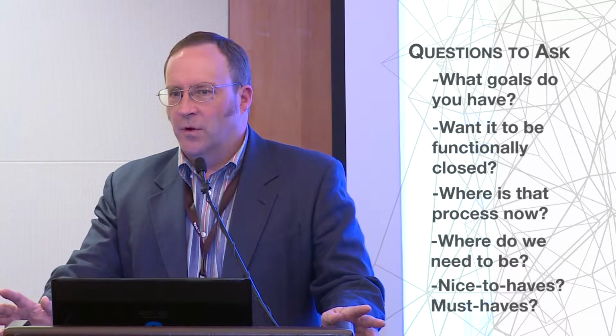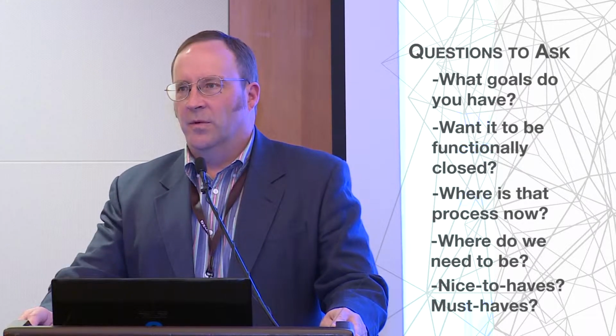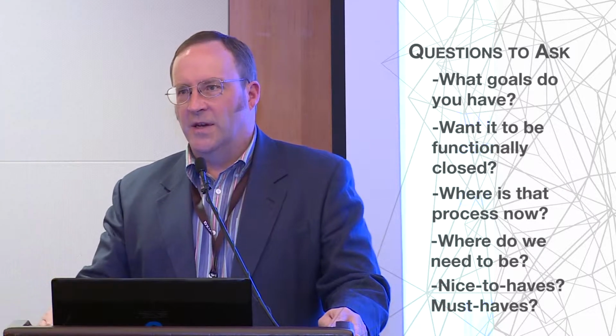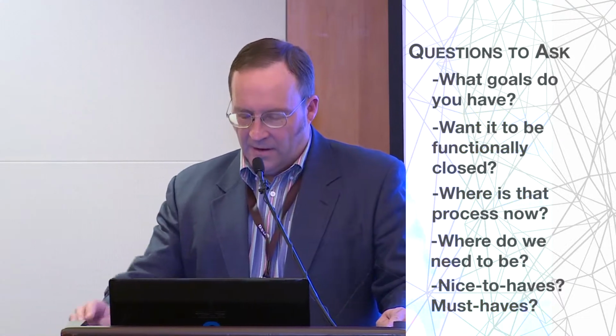The outputs of such work might lead you to a phased development plan where your process development people need to make some modifications to the process to fit with the automation and the disposables for functionally closing the process. But you may decide not to do all of those activities in one big project. You might spend the capital, do the development to get it to a stage where it's suitable for phase 3 or early commercial production before investing the dollars to take it the whole way.